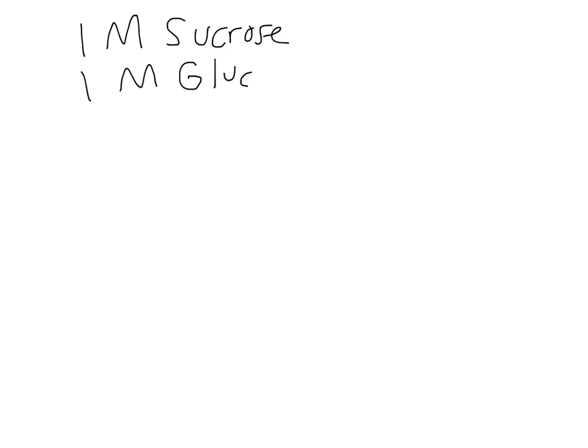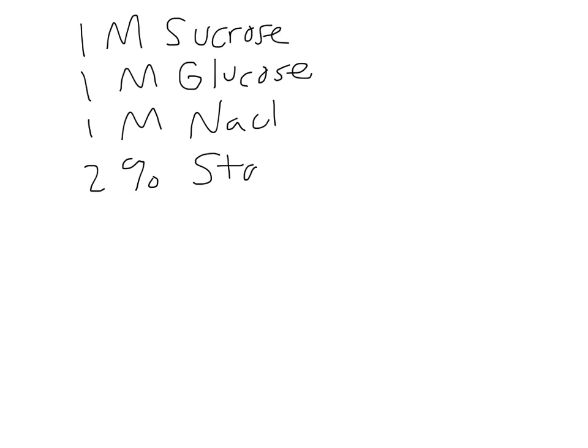So basically what you guys are going to be doing, you're going to have a bunch of different solutions. You're going to be given 1 molar of sucrose, 1 molar of glucose, 1 molar of NaCl, 2% of starch, and of course water.